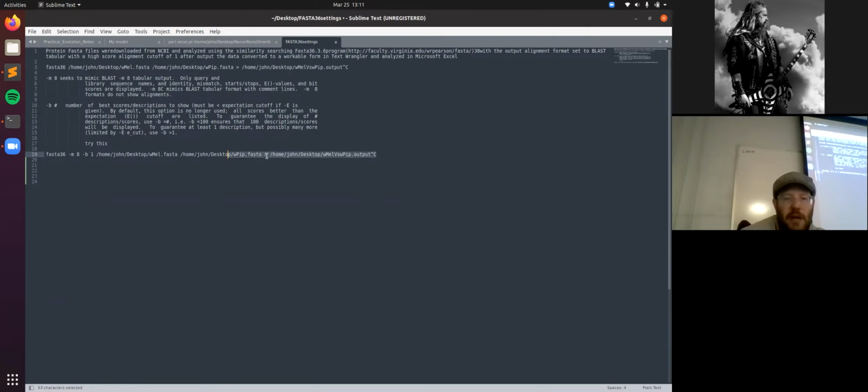If you look at this command, this is the actual command that, when I finally figured out how to run everything the way I wanted to do it, this is what the command looked like. Okay, so it's a pretty complicated command. And we can just dissect the parts of this as an example of what you're going to encounter.